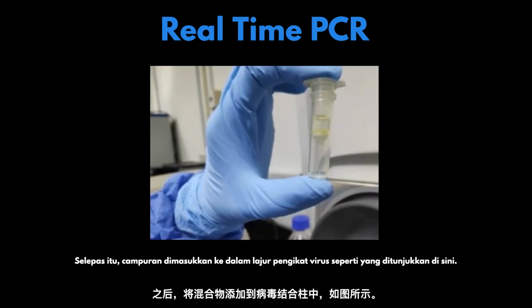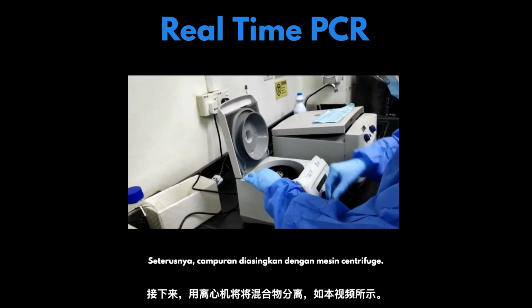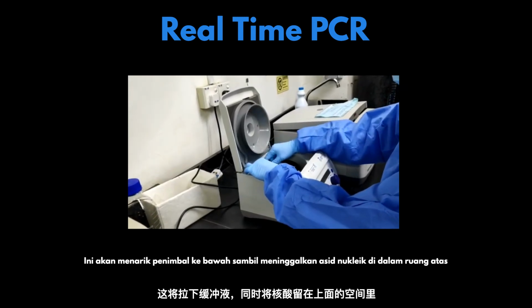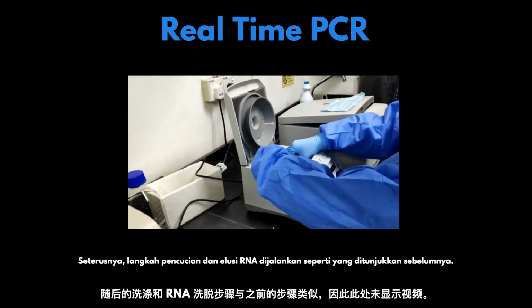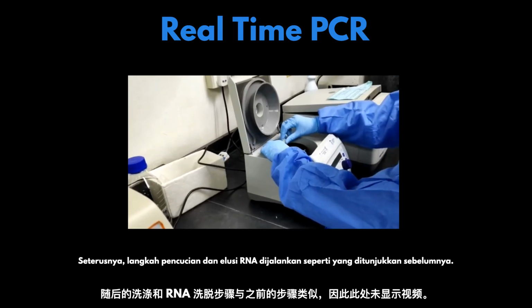After that, the mixture is added into virus binding column as shown here. Next, the mixture is centrifuged. This will pull the buffer down while leaving the nucleic acid in the upper chamber. The subsequent washing and RNA elution step are similar to previous steps, so the process is not shown here.